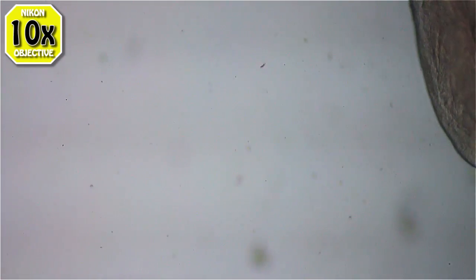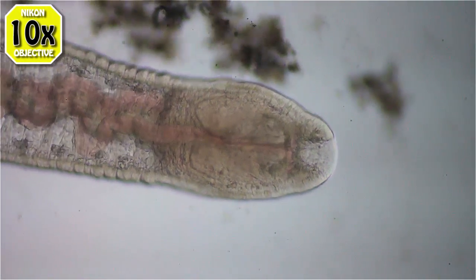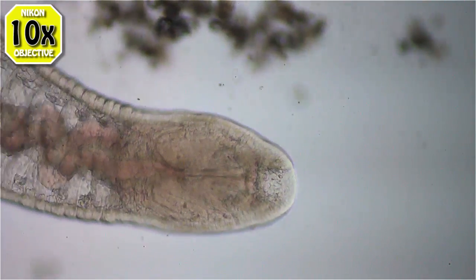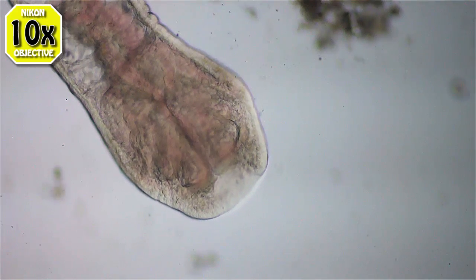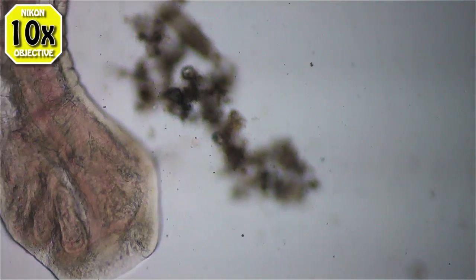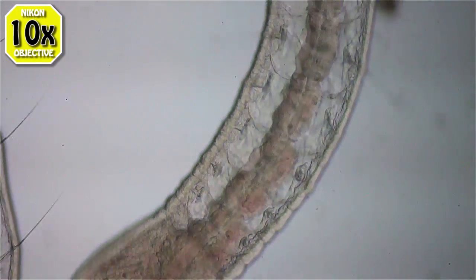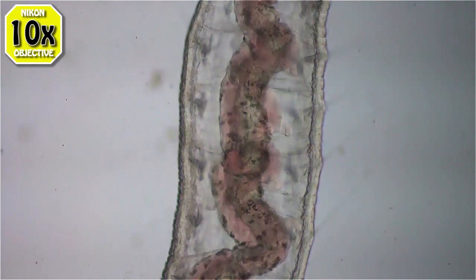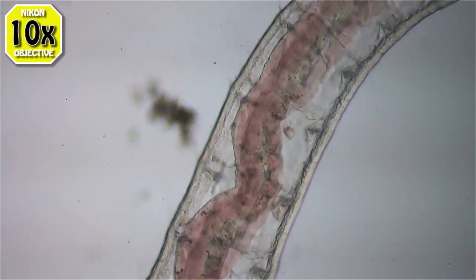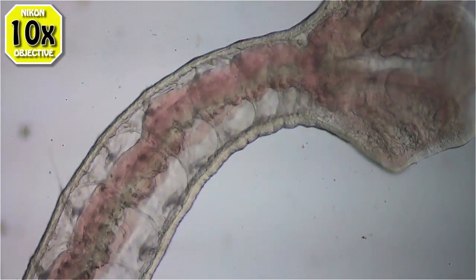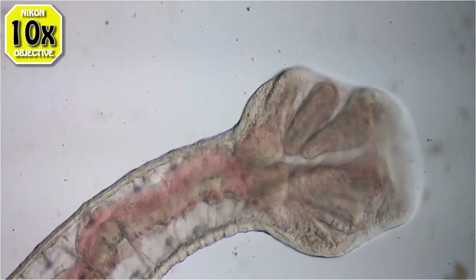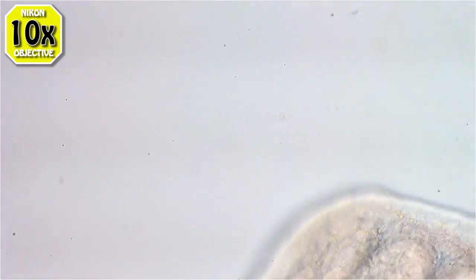And back to oblique. I'm going to try and get some better shots of this tail. I've seen other similar worms that had the gills but there were many more of them and they were outside the body hanging off like bananas on a tree. There, see how they're expanded?